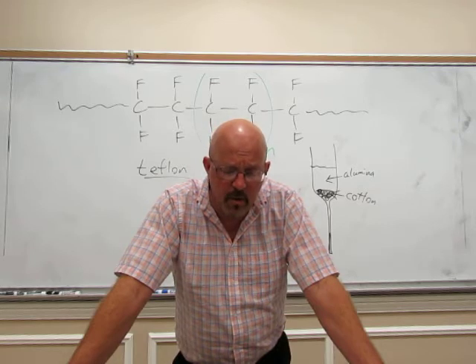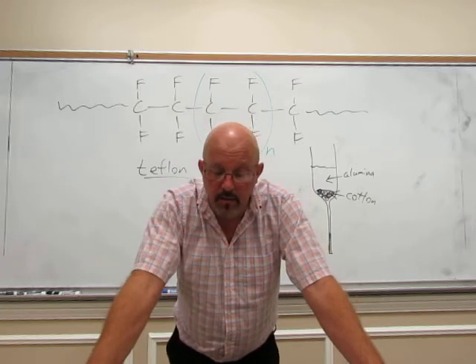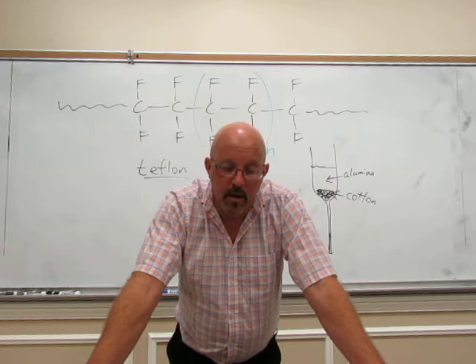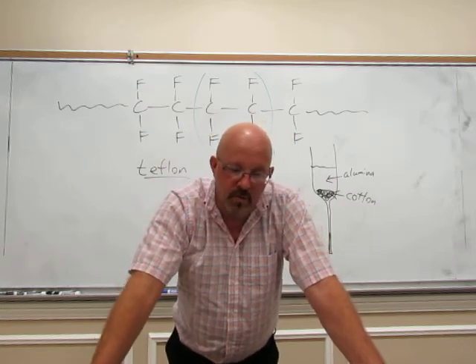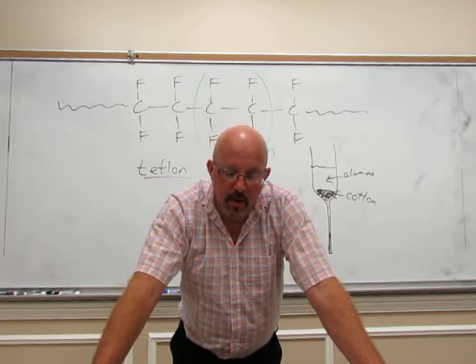Once the reaction gets going, it's very exothermic, so it'll generate its own heat and continue to polymerize. The temperature will keep rising up to about 180 degrees. And if you take that boiling stick and lift it up or stir it, you'll notice the solution is going to get thicker and thicker as it heats.